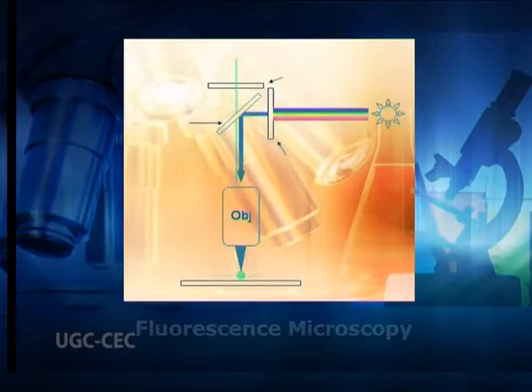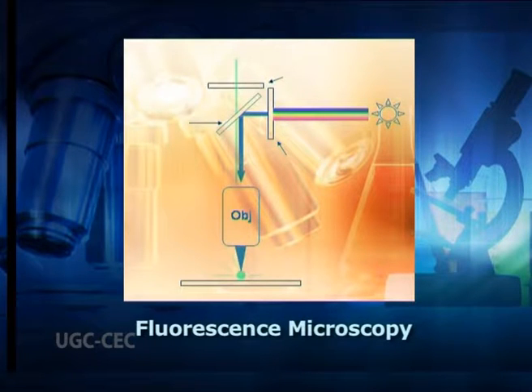Fluorescent microscopy. In fluorescent microscopy, specimens are stained with fluorochromes or fluorochrome dyes. Light of high energy or short wavelengths from halogen lamps or mercury vapor lamps is then used to excite structures or molecules within the specimen, or dye molecules attached to it. These excited molecules emit light of different, longer wavelengths, often of brilliant colors.